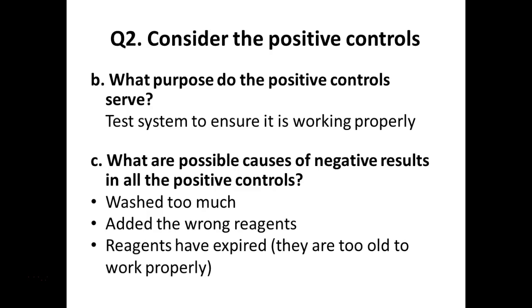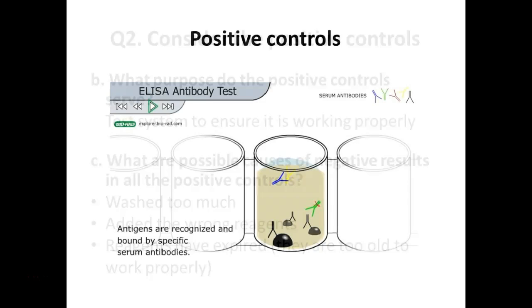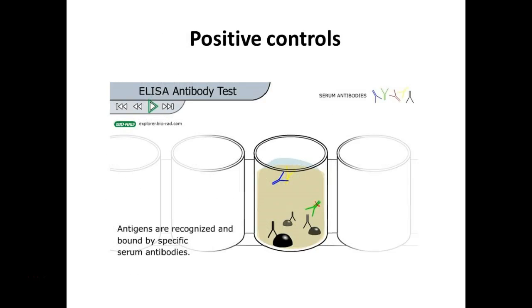The reagents might be expired, which they were. I tested them this morning. I had to reconstitute all new reagents for you guys this morning. So it damn well better work.